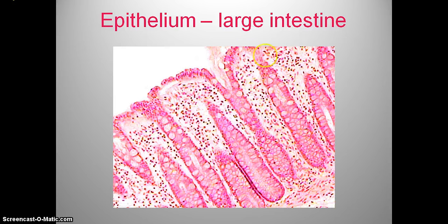This is large intestine. What is missing is villi. Yes, we have so-called crypts right here, but there are no villi. Cells also columnar. Look, this is one cell. This is another cell right next to it. This is a cell. Again, nucleus is pushed to the bottom kind of, and the shape of the cells are columns. We also have some cells which secrete, because we know that digestion is happening in the intestine, so all the enzymes are absolutely necessary and they're constantly produced or secreted.